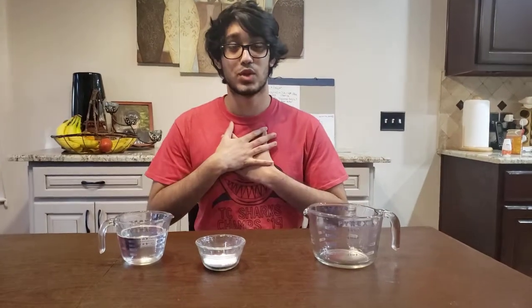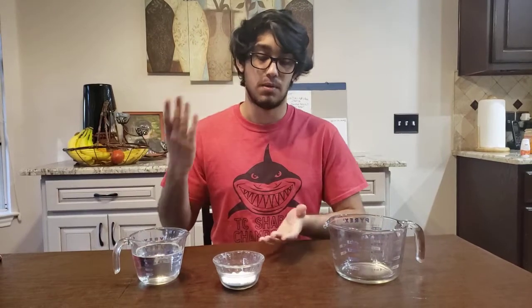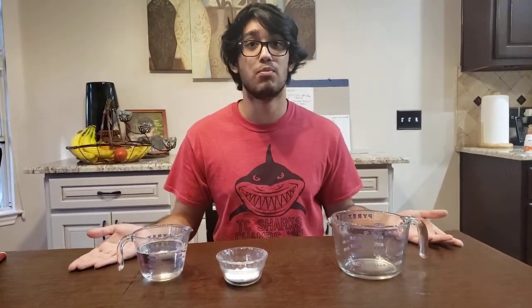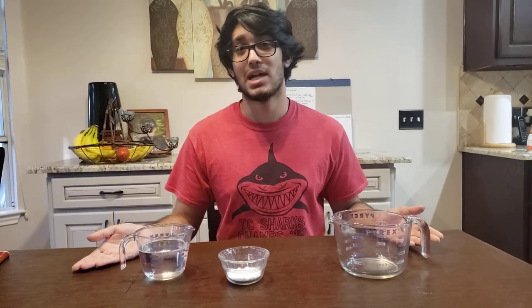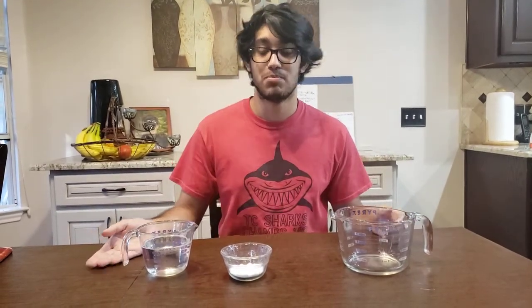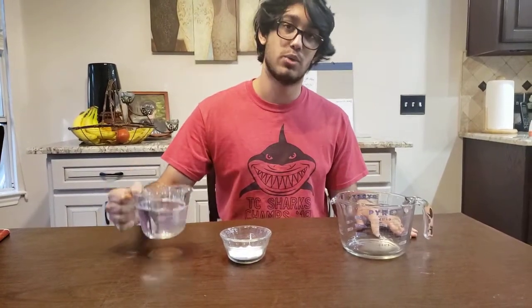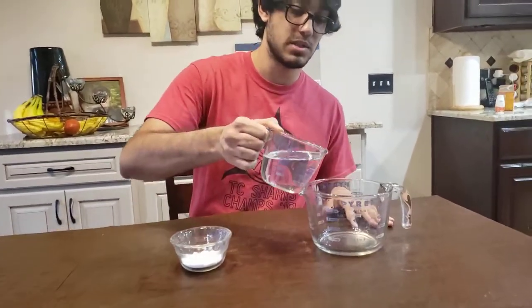Hi, my name is Dhruv, and for my chemistry final, I'm going to be doing a baking soda and vinegar reaction. Now this may seem simple, but to quote the great Matt Damon, I'm going to science the crap out of it. So we have 250 milliliters of vinegar right here, which I will pour into this.